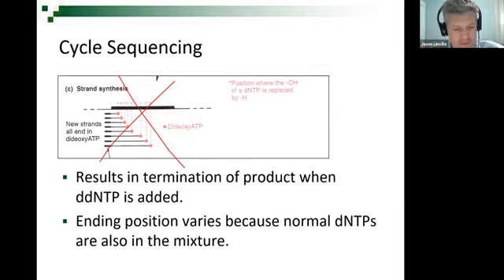All right, two things are going to happen. Basically, you put this in the thermocycler and thermocycling starts, okay? And if you remember, what happens with thermocycling? Well, you have amplified DNA, which is double stranded. So it goes up to 94, the amplified DNA comes apart. You go down to like 55 degrees, the primer, just one, attaches. Everything's the same so far, right? You heat it up to 72, the polymerase attaches. Still the same as the PCR we learned before.